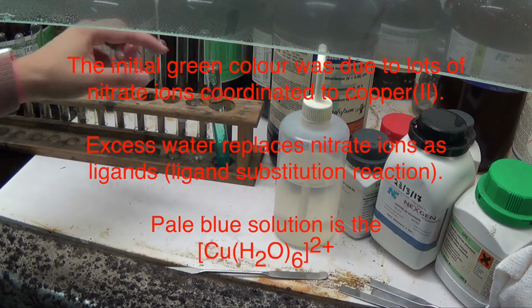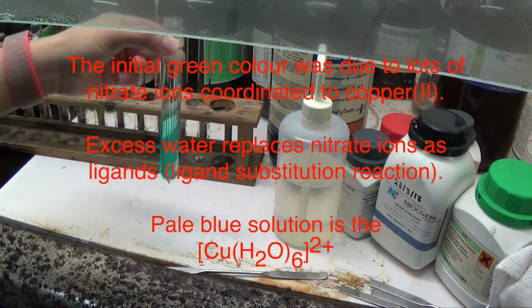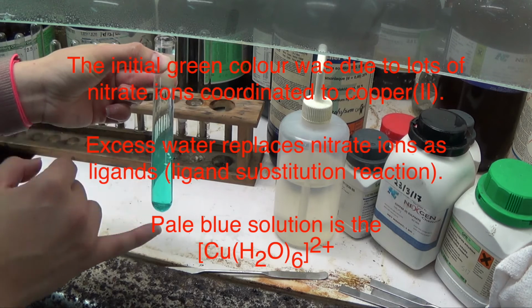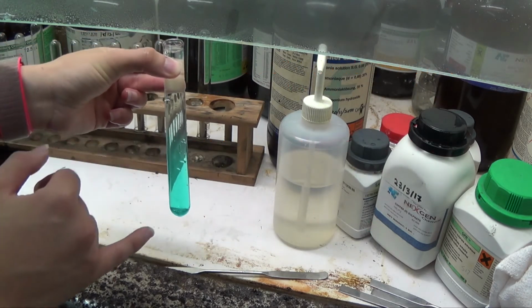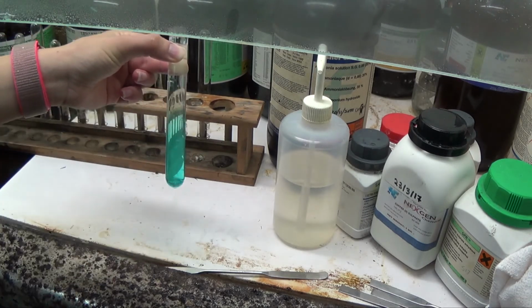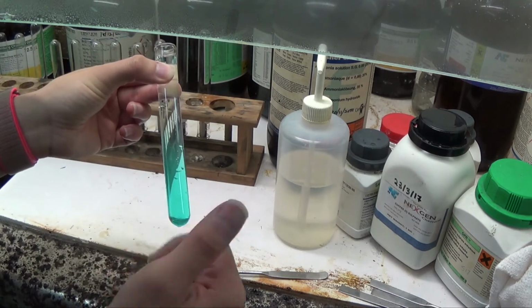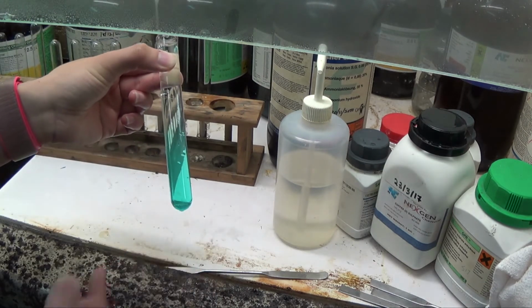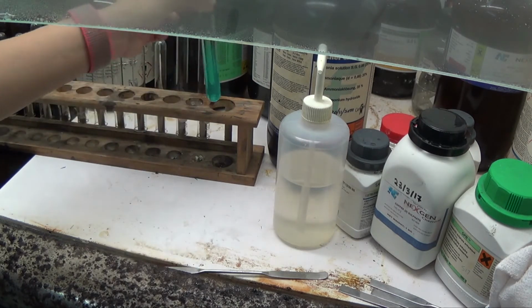So I've killed off this reaction by adding a lot of distilled water, and the reaction has stopped. Now we get a blue solution because that is the copper 2+ aqueous. As we know, copper 2+ in solution forms an aqua complex, which is blue. The copper metal, the pink brown solid, has disappeared because it has completely reacted with the concentrated nitric acid. Okay, so I leave it there.